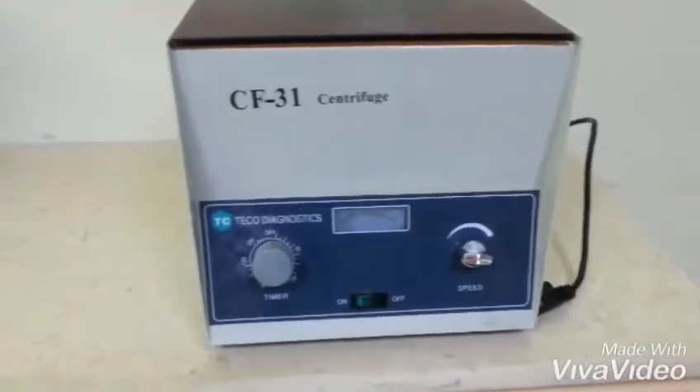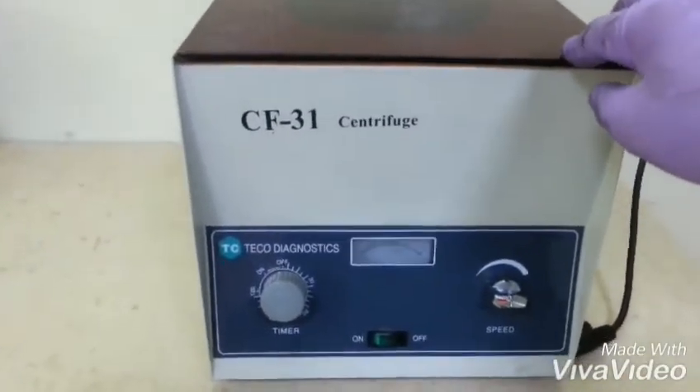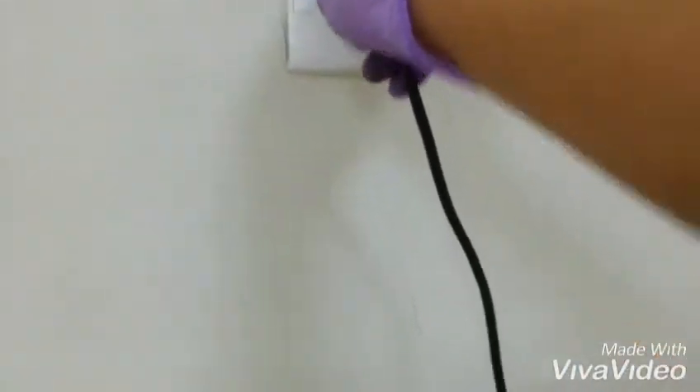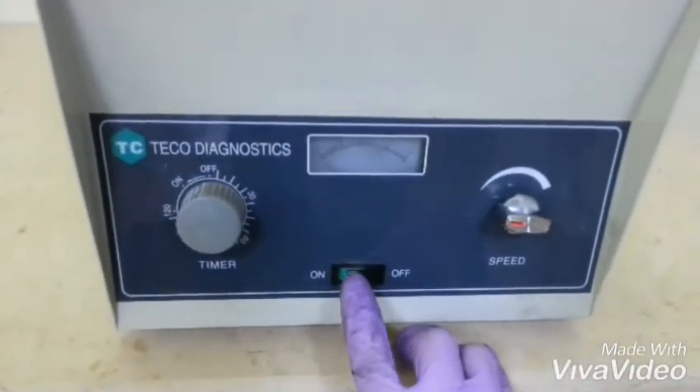So, now we will see if this machine is already functioning after changing the carbon brush. Let's see. Put the plug on. And then turn on the machine.